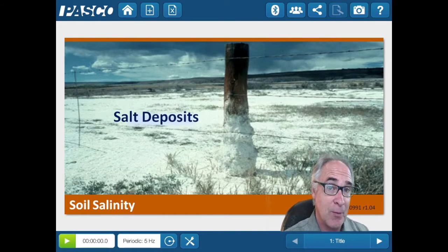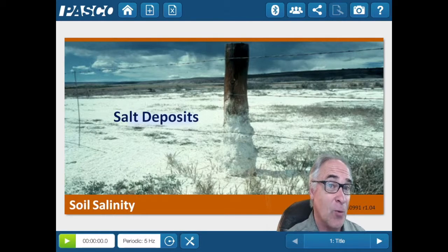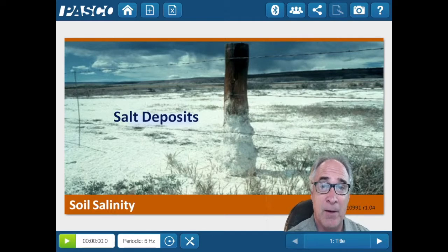Alright, now if you remember from last time, what we did is we went ahead and uploaded it from our website. Now if you don't remember that, or you're absent, really go see part 1 of this series and re-watch it. So for those of you who remember and haven't watched it, we're going to just dive right in right now.